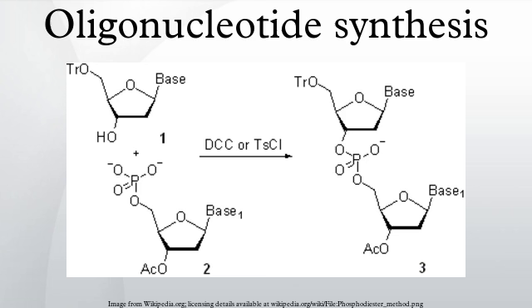It has also been reported that phosphoramidites activated with 1H-tetrazole react, to a small extent, with the O6 position of guanosine. Upon oxidation with I2/water, this side product, possibly via O6 to N7 migration, undergoes depurination.